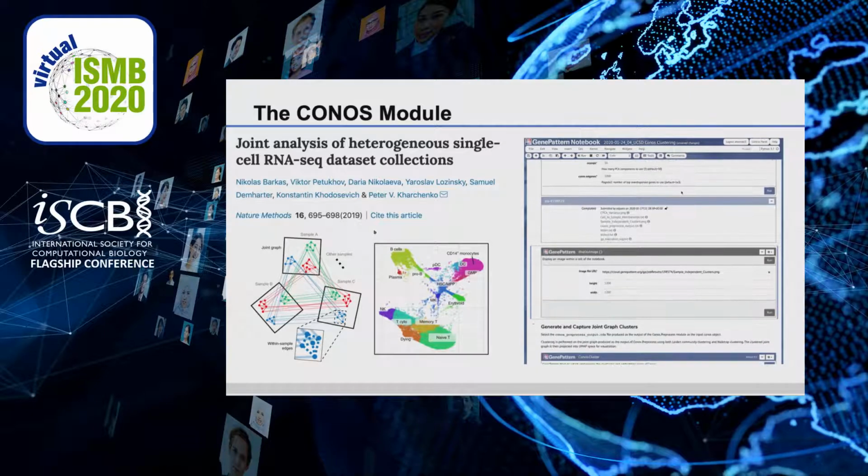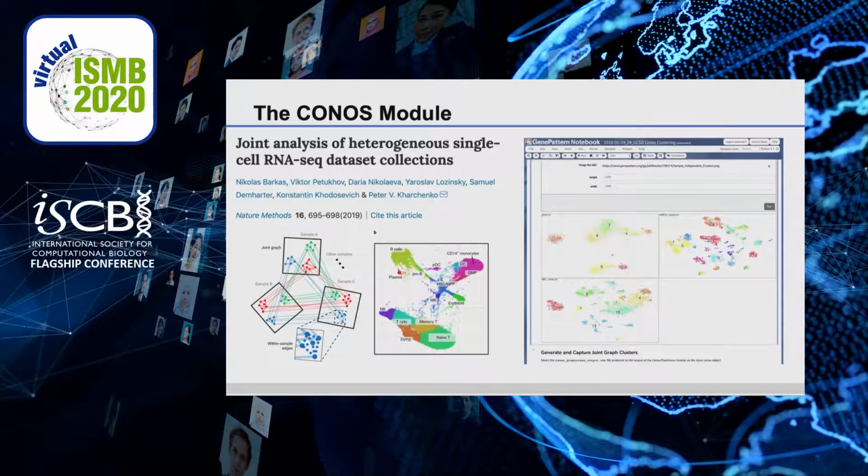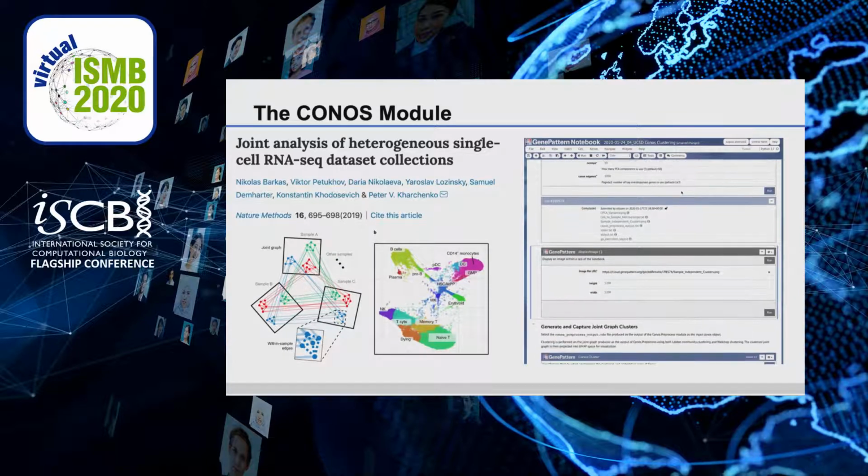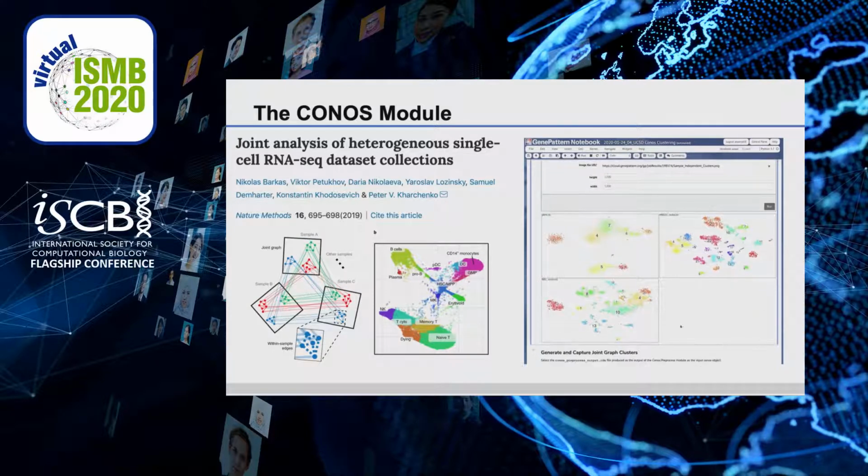We will soon make available a notebook that encompasses this workflow, utilizing GenePattern modules to perform the heavy lifting in the cloud while enabling users to interact with the results and configure and generate the plots in real time.